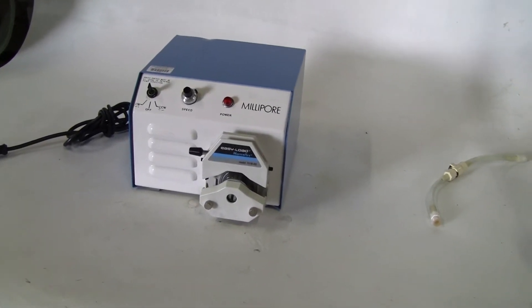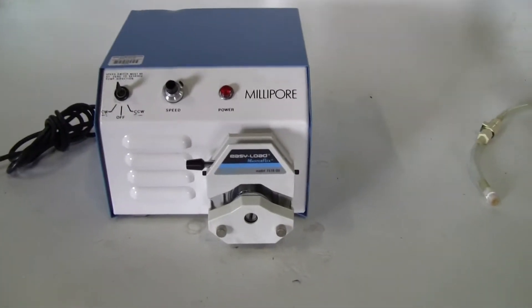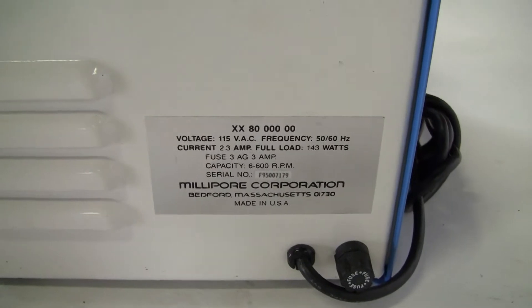Hi, this is Jim, High Tech Trader. We're looking at a Millipore peristaltic pump, Model XX80000.